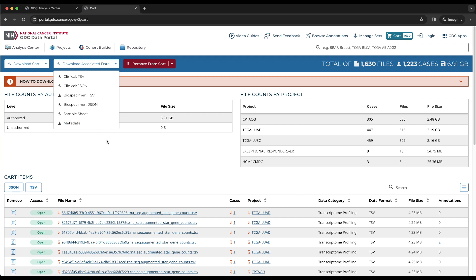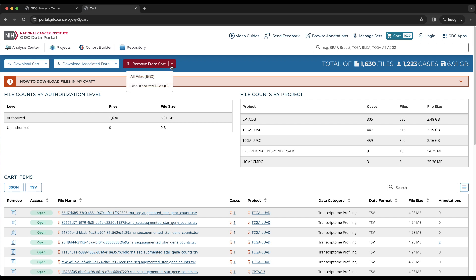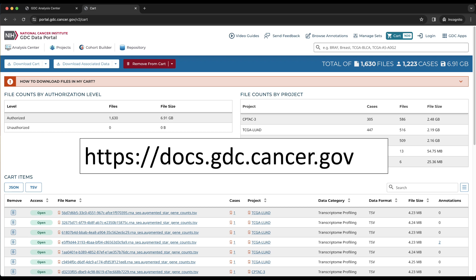The remove from cart button allows for files to be removed from the cart and has two options. All files removes all files from the cart so that the cart is empty. Unauthorized files removes only the files that are labeled unauthorized. For more information on the GDC data portal, please refer to the other videos or go to docs.gdc.cancer.gov.